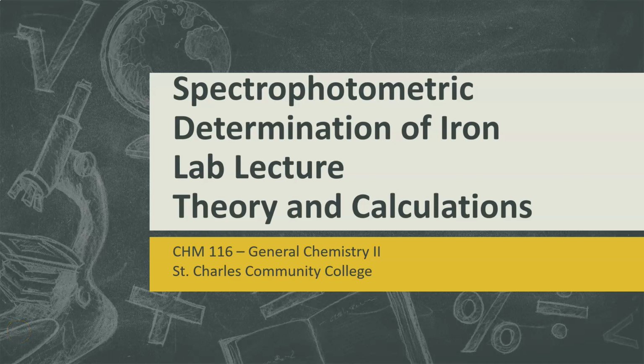This is the Theory and Calculations Lab lecture for the Spectrophotometric Determination of Iron lab. For this lab, we'll be talking about spectrophotometric determination for the first time, and then the next lab, the equilibrium constant lab, will still be using the same ideas, theories, and calculations as this one. So this one will be one to refer back to if you're running into problems in future labs.